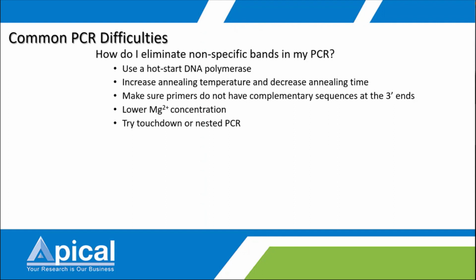Another one is, if you experience smearing on gel electrophoresis after PCR, first eliminate the possibility of contamination by running a negative, or no template, control together in your PCR.